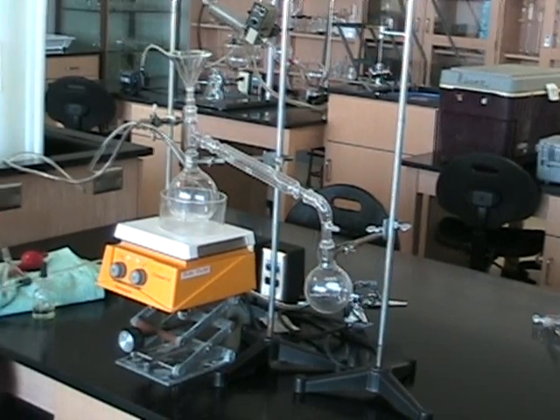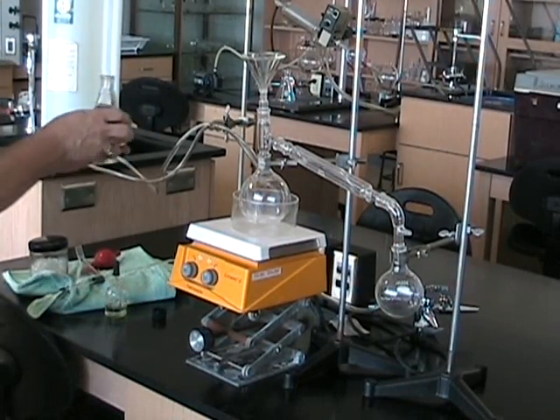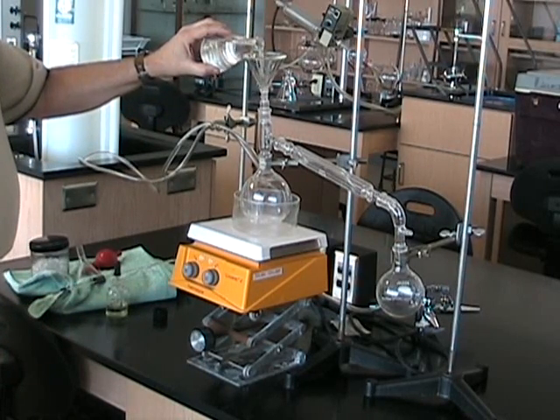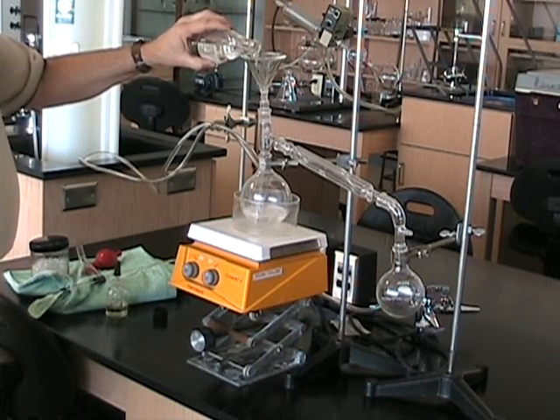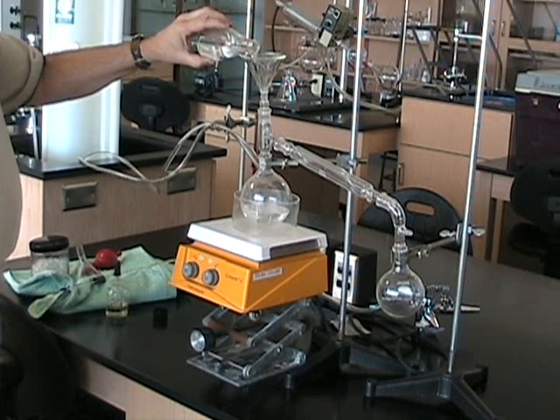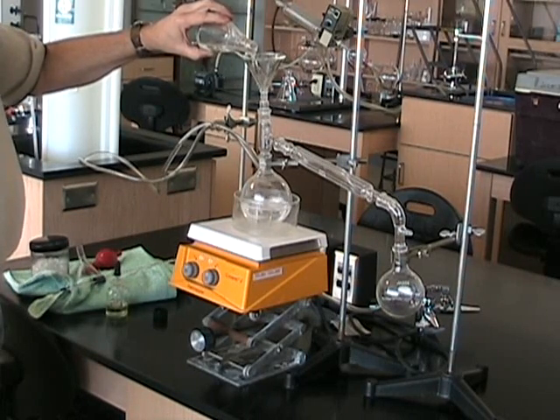We're going to charge the flask using a 60-degree filtering funnel right down the old thermometer port. And here we go with our magic elixir. We use a funnel to do this so that the liquid pours straight down into the bottom of the flask and doesn't go down the side arm into the receiver. The reason for that, of course, is purity of the product.